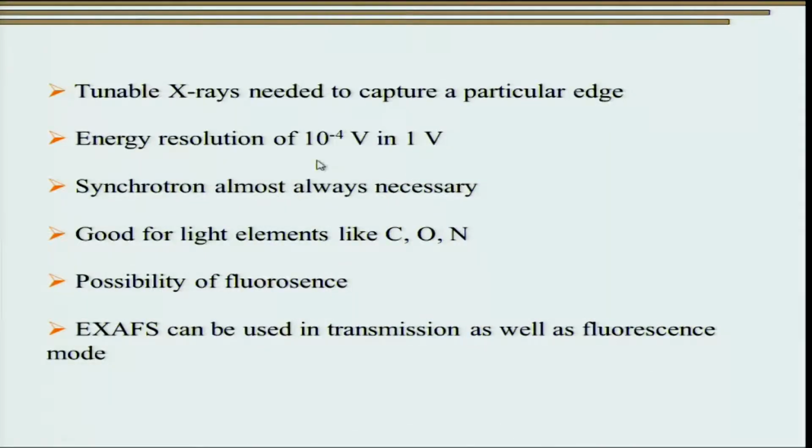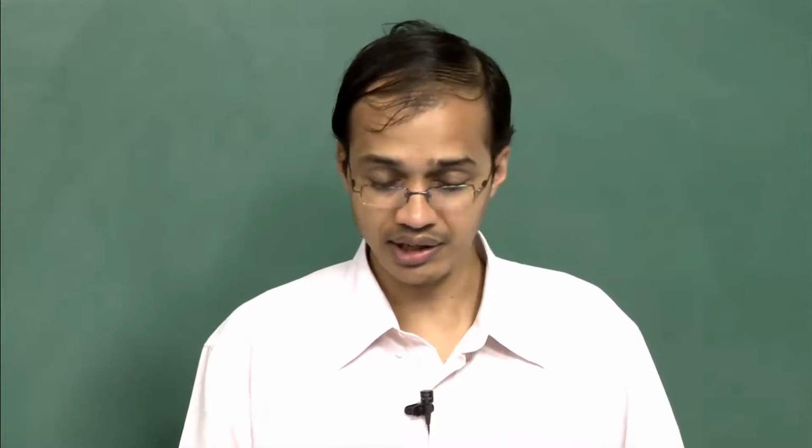Not only that, we also need an energy resolution which is very good, of the order of 10 power minus 4 in 1 volt, and therefore in most cases we have to use a synchrotron source for carrying out EXAFS study. Having said that, the main driving force for carrying out EXAFS is to study light elements like carbon, oxygen and nitrogen. Now, these elements cannot be very well studied using conventional spectroscopic techniques.